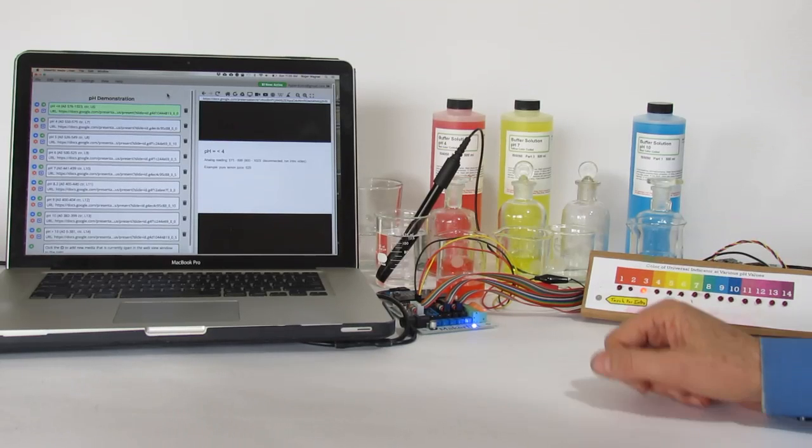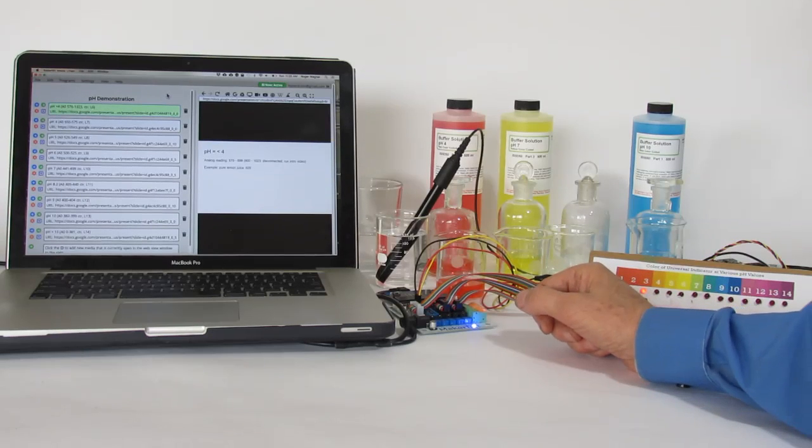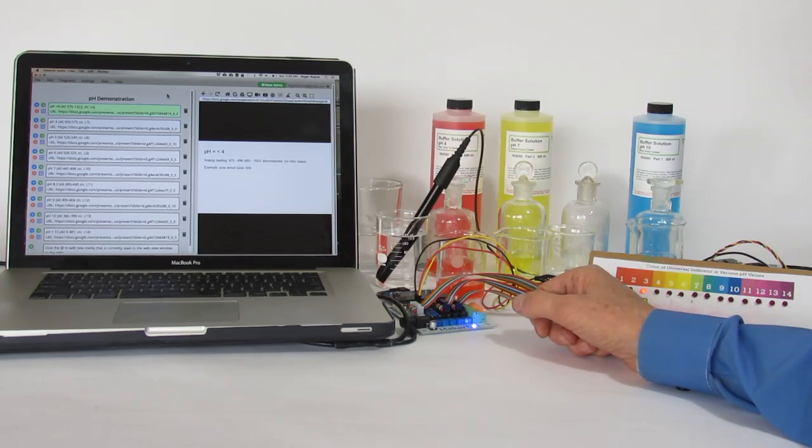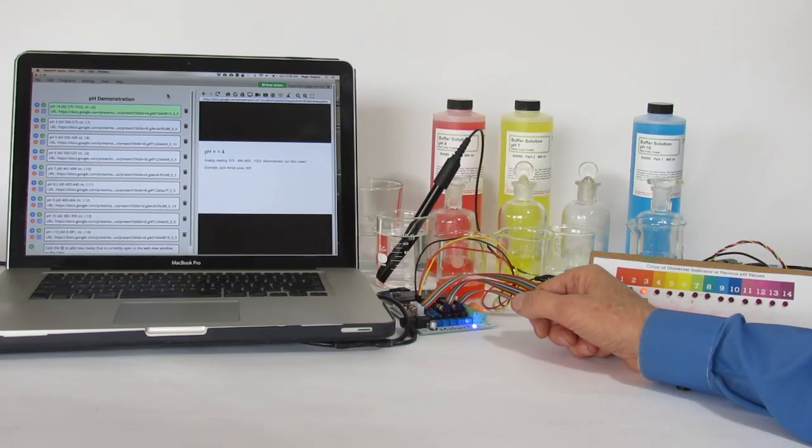Hi, this is Roger Wagner, and this video is a demonstration of the MakerBit with the Vernier pH sensor.